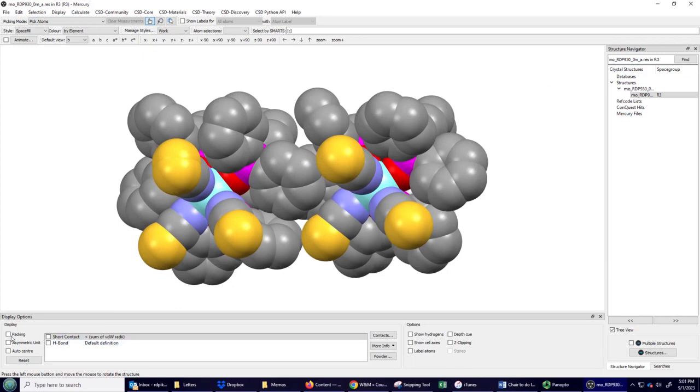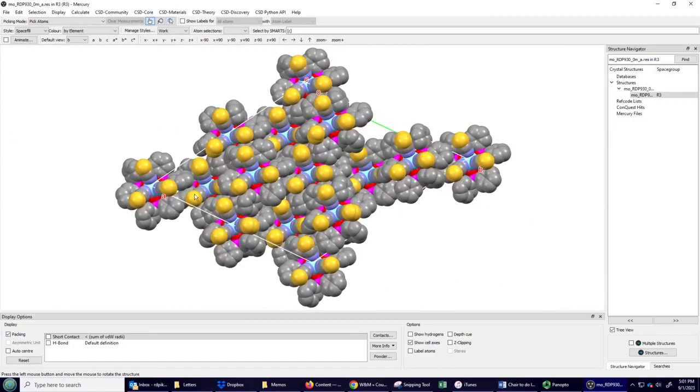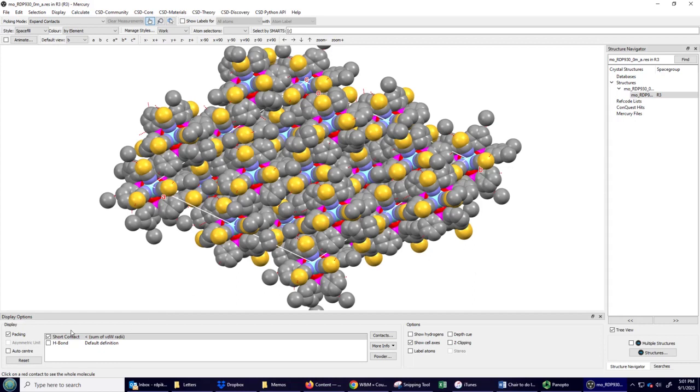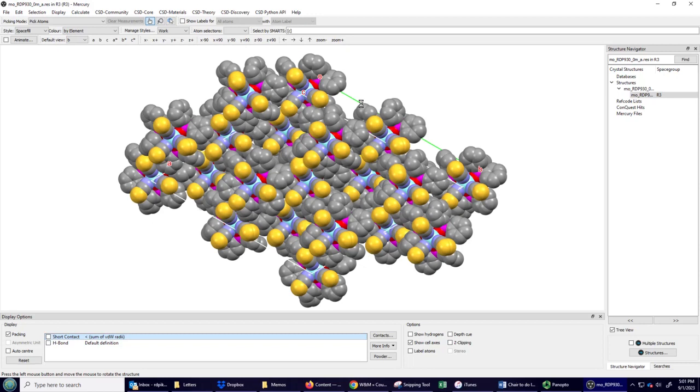And let me further expand this by showing the packing diagram. The packing diagram shows me the unit cell, that is the smallest crystallographic repeat unit, the smallest unit in space that only has to be repeated in any given direction to completely fill space and create the entire crystal. It almost looks like there's some pieces missing here, but that's just because there's other molecules that are peeking into the unit cell in those spaces. So I can fill it further by adding some more molecules. And you can see that the old adage about nature abhorring a vacuum is really very true. It looks like I've missed a little bit of addition over here.